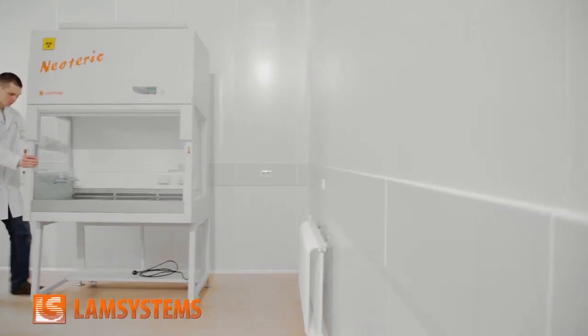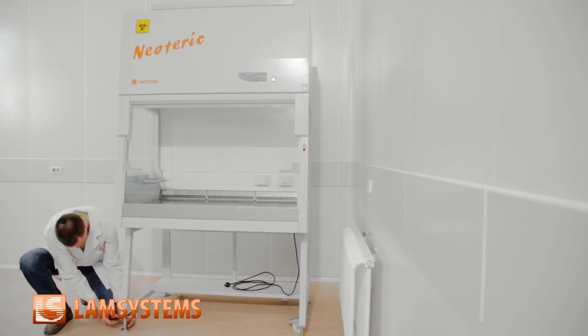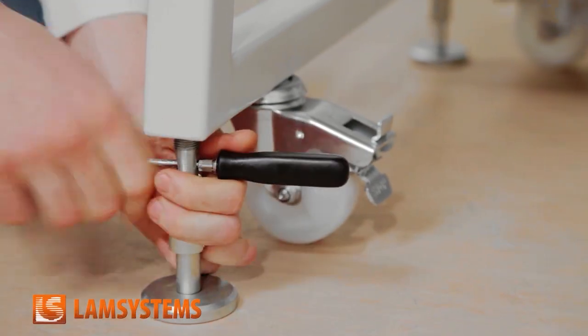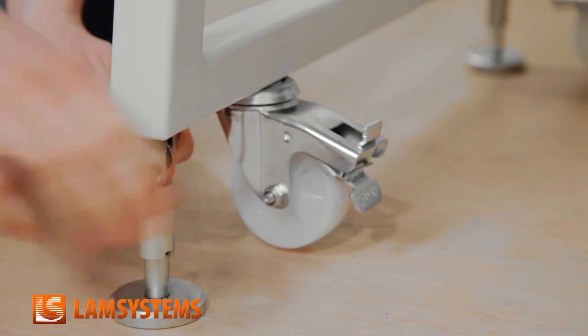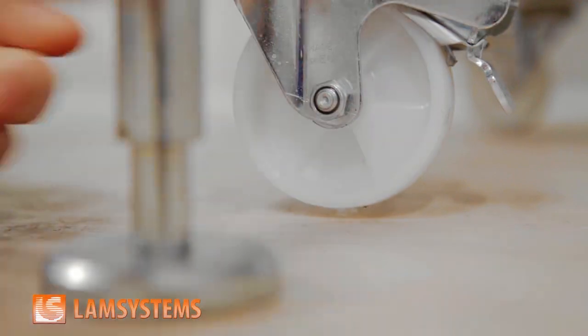Move the cabinet to the place of its permanent installation using the wheel supports and then fix the cabinet using the screw supports. Notice that after you have fixed the cabinet with the screw supports, the wheels should not touch the floor. It is necessary to leave at least a 5 mm gap to avoid an accidental cabinet displacement, as even the slightest relocation entails the compulsory procedure of technical condition control. This is a requirement of a standard.